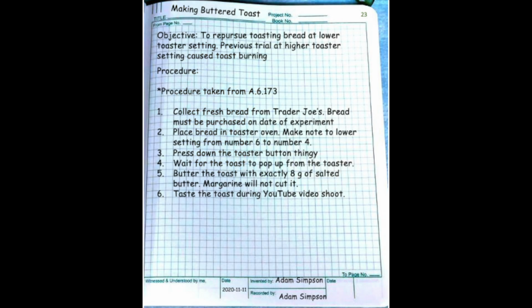After referencing the procedure, I highly recommend that you rewrite your procedures, just because there's always this one small step that if you forget to do, it throws the whole experiment off, and you may have to repeat the experiment just because you forgot to spike some internal standard or surrogate, or in this case use the right type of butter to make the toast taste good. So you need to rewrite your procedure just so that you can stay consistent and remind yourself of those small things that you might forget about.